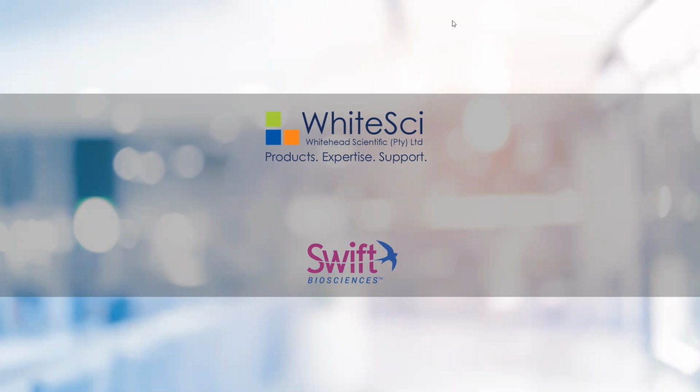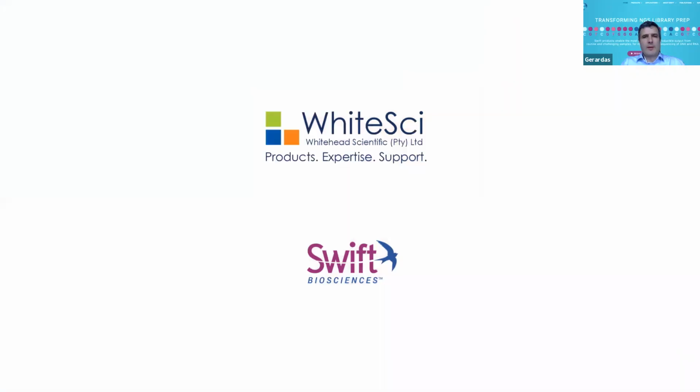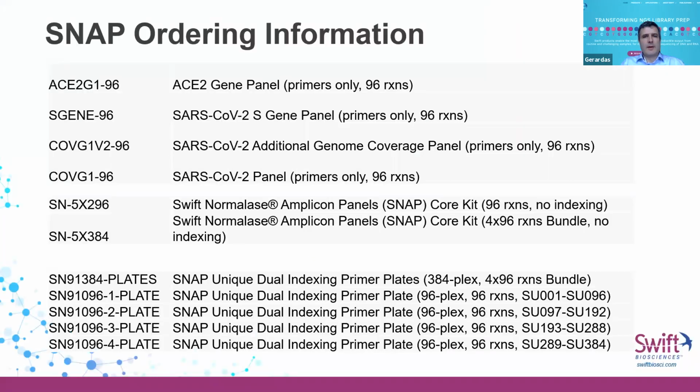The other one is pertaining to the reagents. So you have the various panels, and for all of the panels of primers, you have to use the core kit. Am I correct? Correct. Yes, that is correct. So core primers do not go separate. For all of them, core kit, yes, the reagents are the same. If I go a little bit back to my last slide, the core kit is universal for all of these panels that you see here, and for the other gene-specific panels in our portfolio.